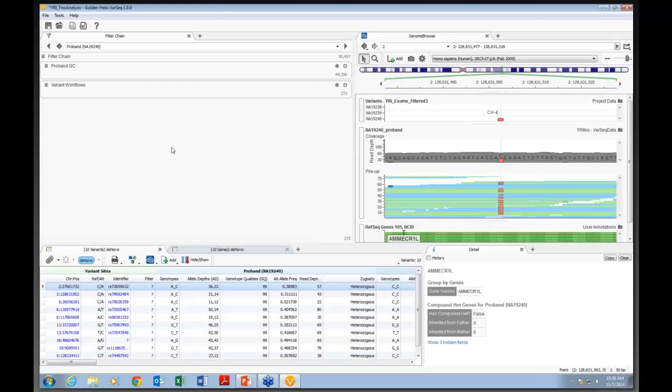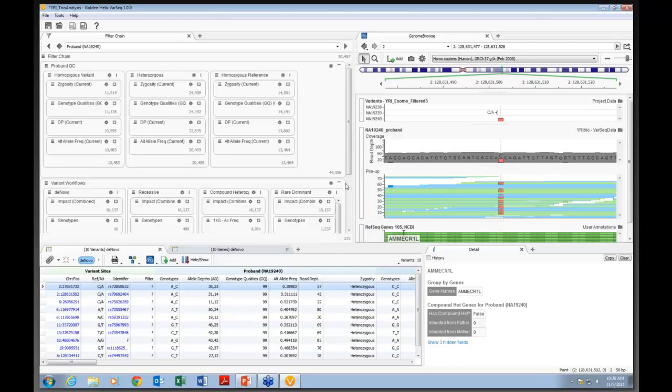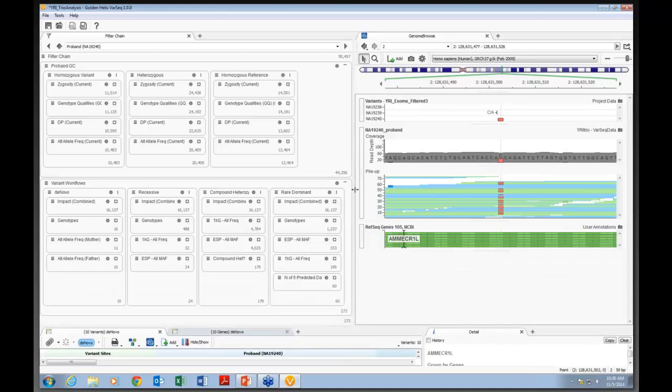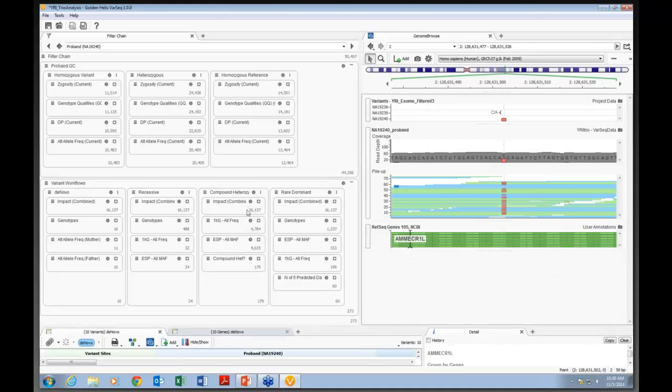As we look at this, you'll notice this particular project is maybe a little bit more complicated than the gene panel workflow that we saw. If we expand this out so we can see the whole thing, let's talk about what you're seeing and why it's important. With the gene panel workflow, we saw just 3 parallel columns representing 3 different workflows.